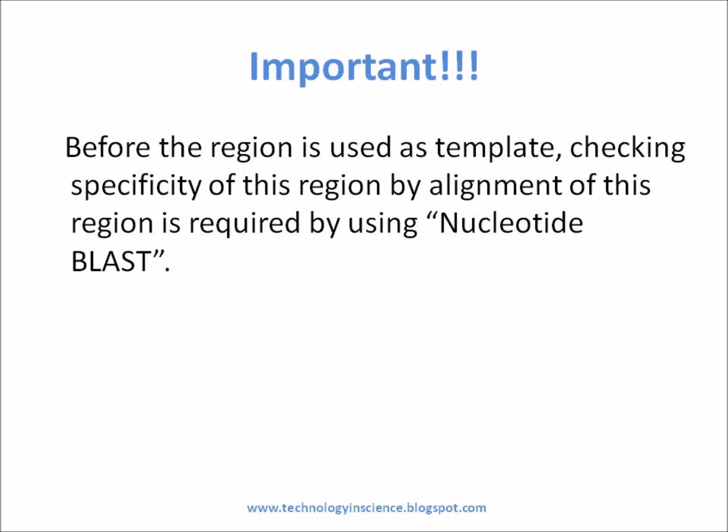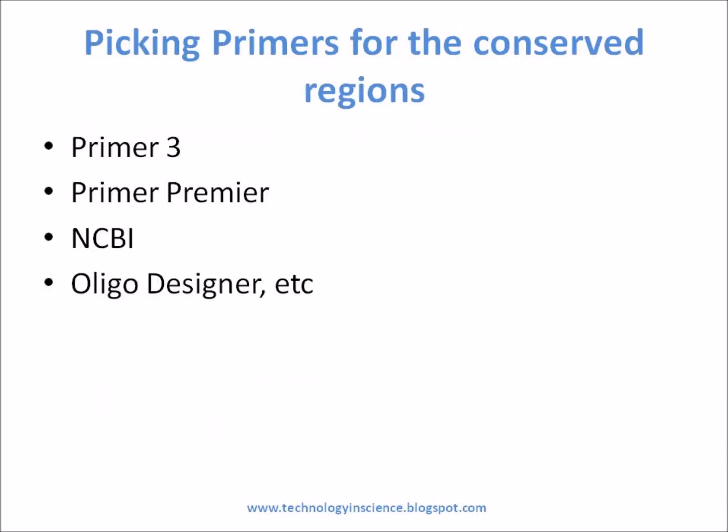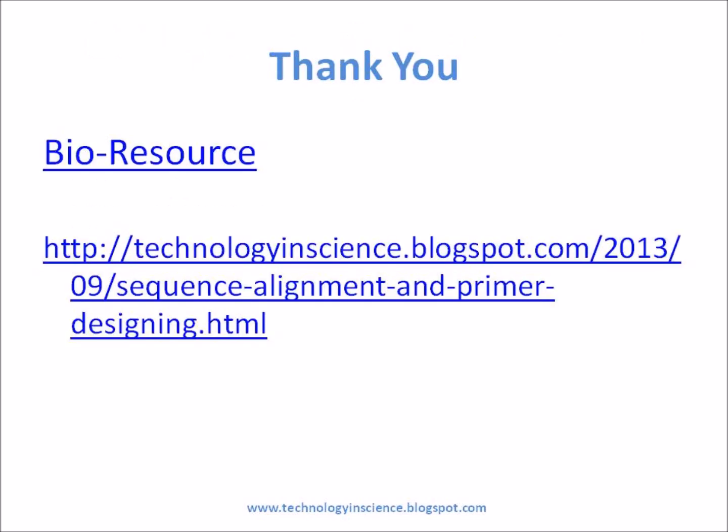Conserved regions are important because these regions will have the least mutations, so they are ideal regions for designing primers and probes for real-time PCR. Primers can be picked up from the conserved region using one of these software tools.